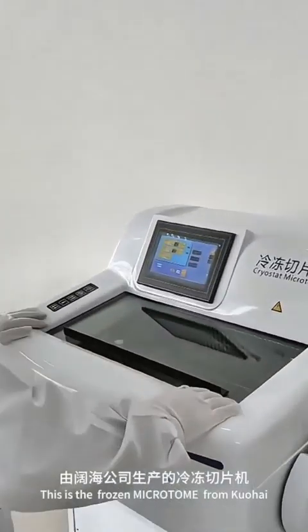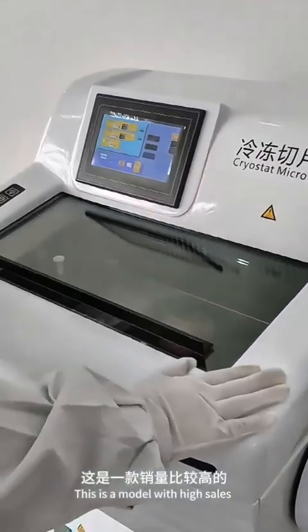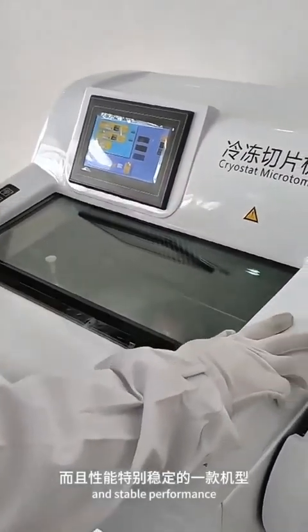Take a look — this is the frozen microtome from Kuohai. This is a model with high sales and stable performance.